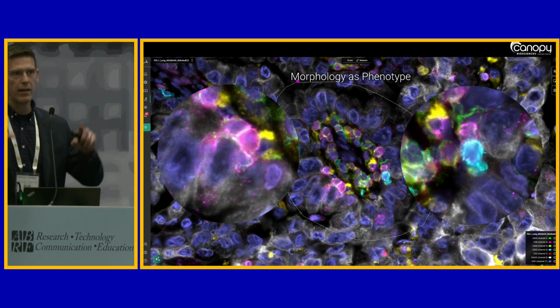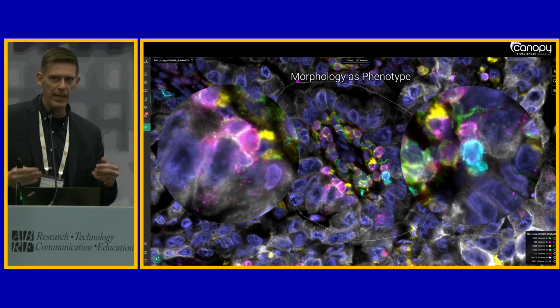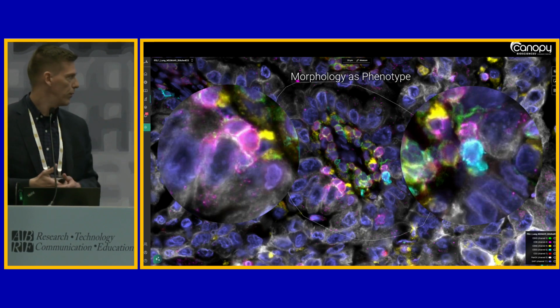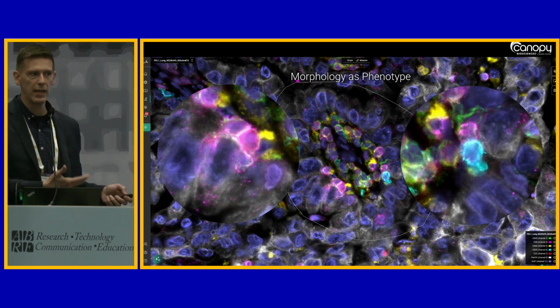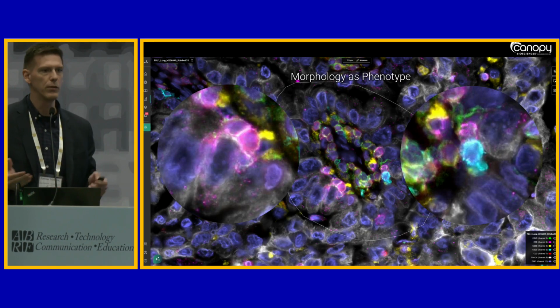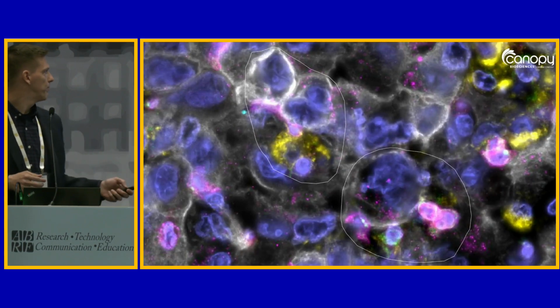Same thing on the left. Those are 2 T cells attacking cancer cells. So I don't have to say maybe they are. I can see that they're interacting. I can see the envelope of the membrane that's surrounding those other cells. So this in itself is very powerful, and this is really what people want out of imaging. This is what microscopists see all the time. This is what these deep learning algorithms are trying to encode. It's incredibly powerful stuff.